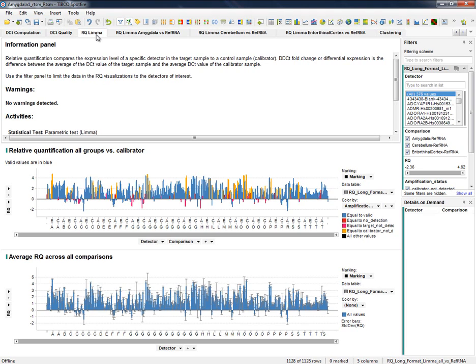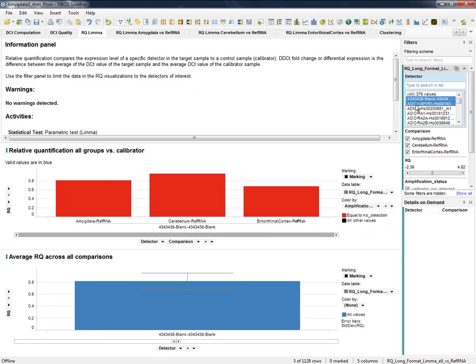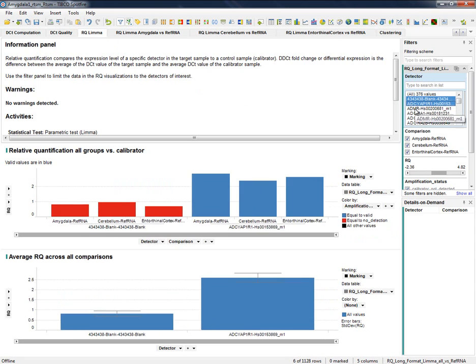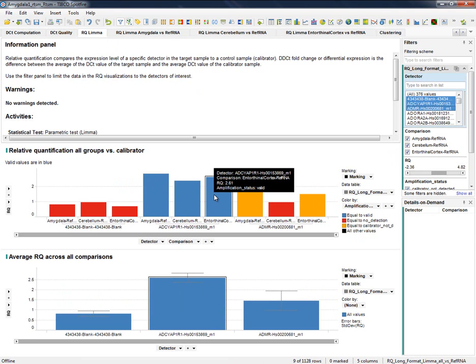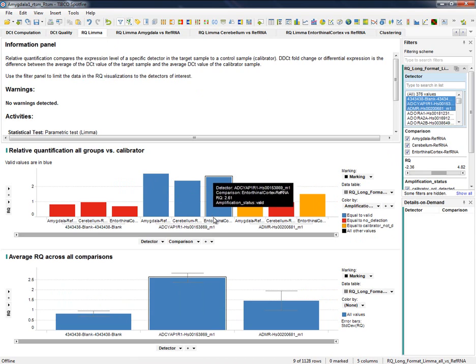To better inspect these results, it is highly recommended to use the filters available on the right side of every report. For example, assuming we are interested in these three detectors only, we can select them and get a better view of how they are expressed along every tissue.